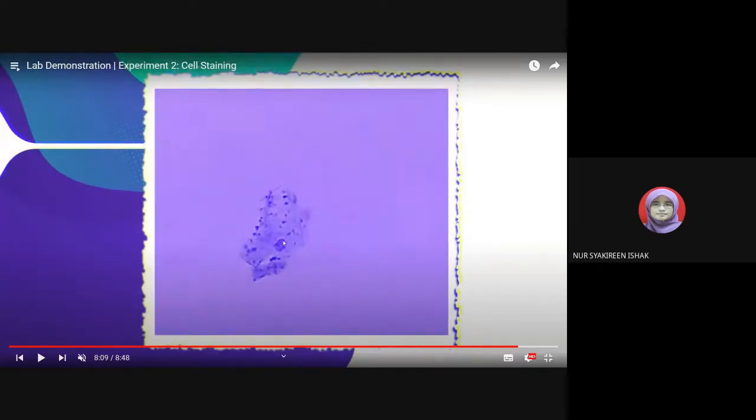Okay, so this is the image observed under the 40 times lens, which is 400 magnification. So you just draw this one cell and then you label every structure. Remember, although you are drawing the same structure, plant cell, animal cell, every time you draw your drawing, you must label the structure. For the animal cell, you have the plasma membrane outside as the barrier for the cell, and then you have the nucleus at the center, and inside you have the cytoplasm.